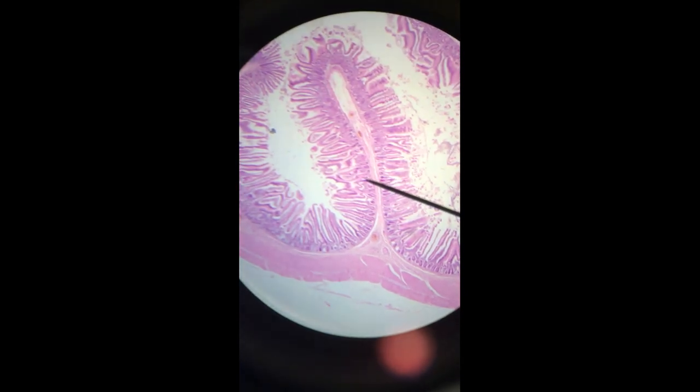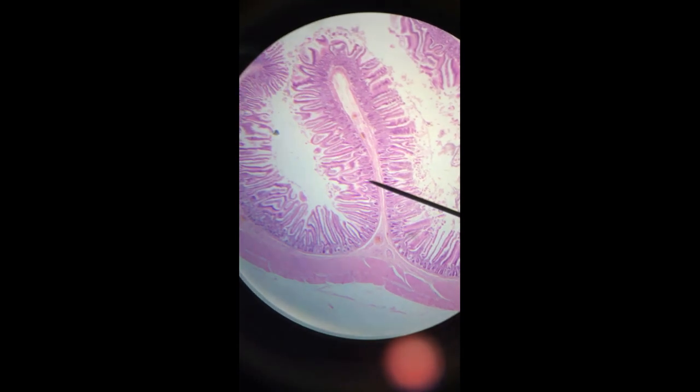That's the muscularis mucosae and it's shorter than this lamina propria. Oh, don't disappear. Shorter than the lamina propria and the epithelium and so they cinch up to make those folds.